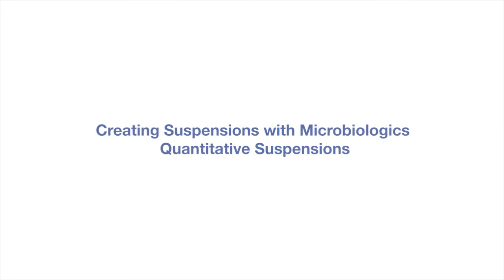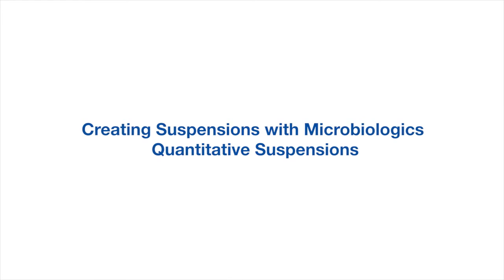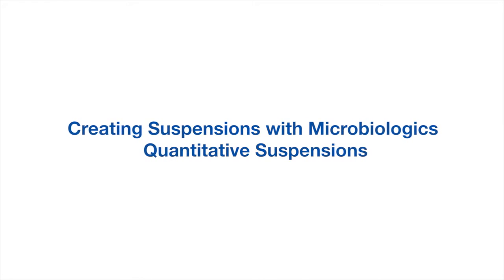So there you have the manual method of preparing microorganism suspensions, taking a lot of time and effort and hoping for good results. Microbiologics makes creating microorganism suspensions simple. So how would you create suspensions with Microbiologics quantitative cultures?